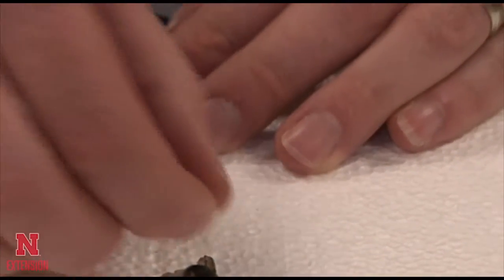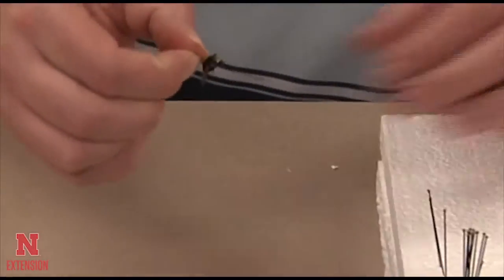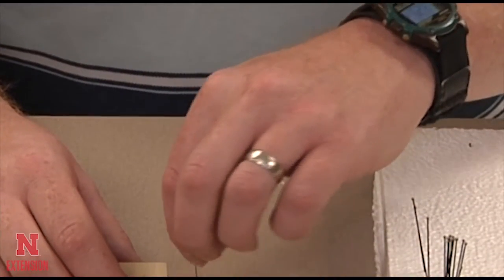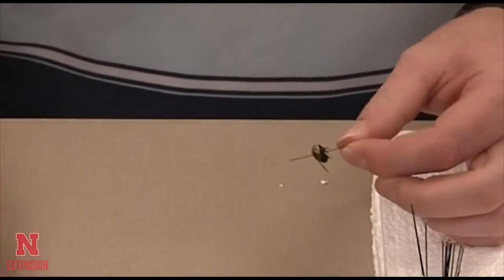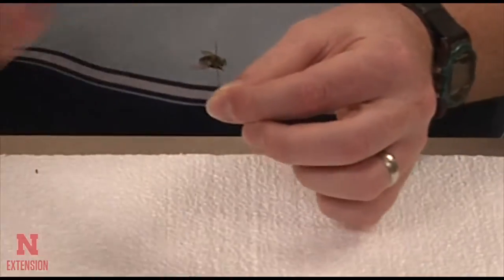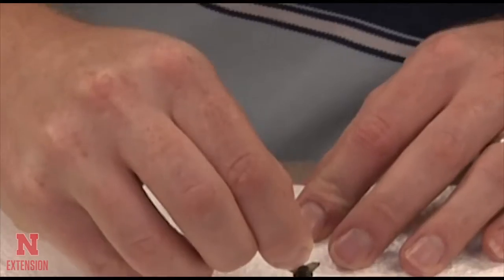Use your styrofoam to push the fly up onto the pin, and then use your pinning block to make sure that it is at the proper height on the pin. In Nebraska, we look for three-eighths of an inch to one-half of an inch in height from the top of the pin.